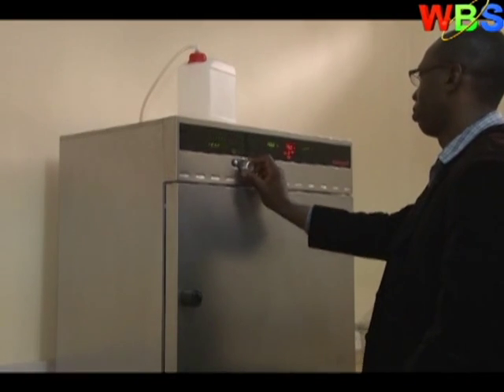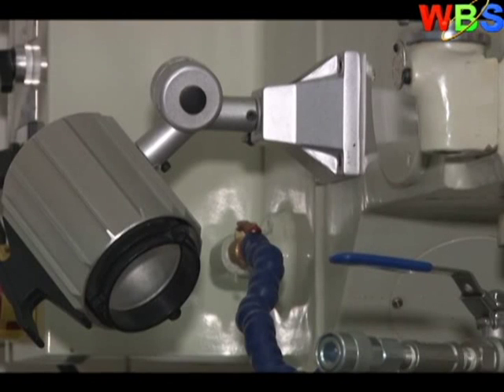The laboratory is expected to save government on money spent on oil testing samples abroad in Arab countries, meaning it also makes Uganda a prime destination for other East African countries to test. The lab has a capability of handling up to 500 feet of core per month, which is enough for a startup here in the region. We don't expect to market more than that in the first years, but as long as the industry keeps growing in the region, we have provisions for expansion as big as is required for the region.